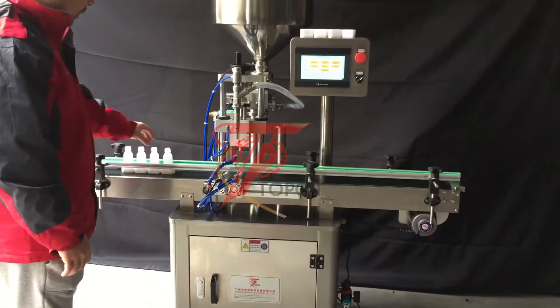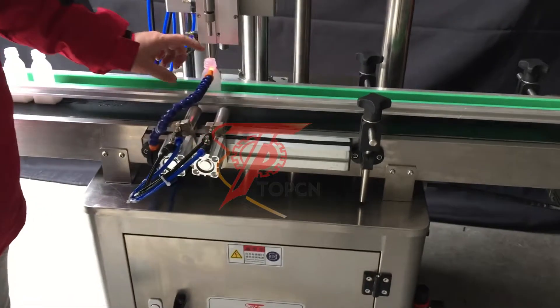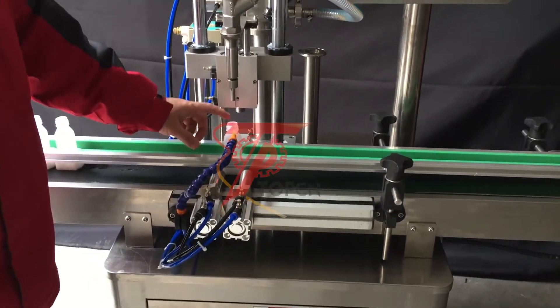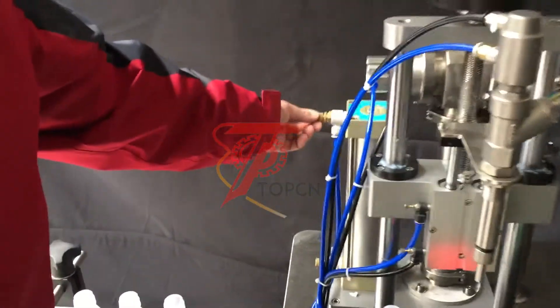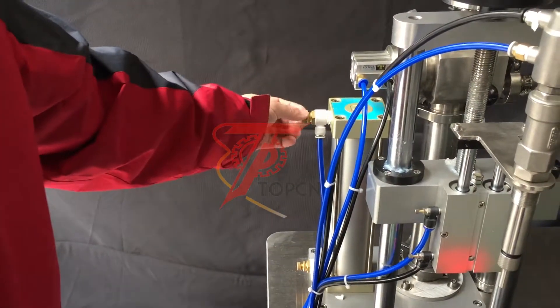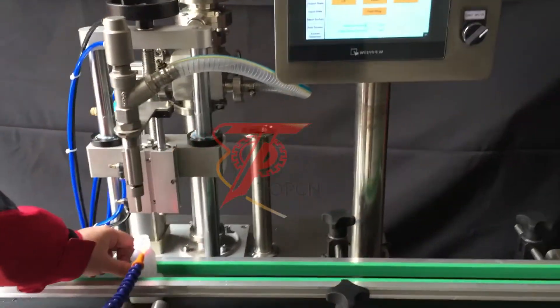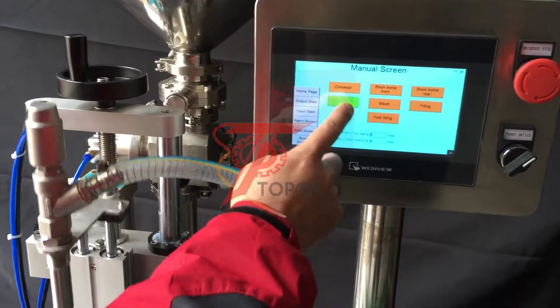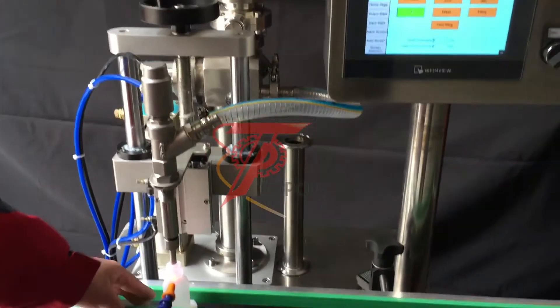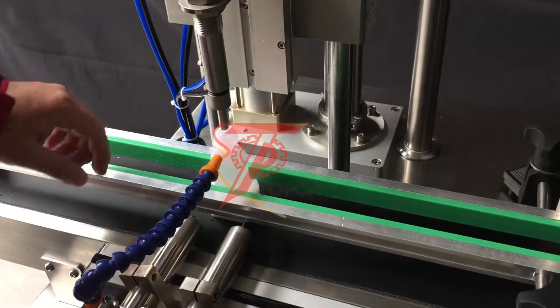If you find the water is being rejected from the bottle, we can simply adjust here clockwise. Let's try — already adjusted. Just pull it down, put the bottle under the filling nozzle, press lift, move down the filling nozzle, and press filling to check.